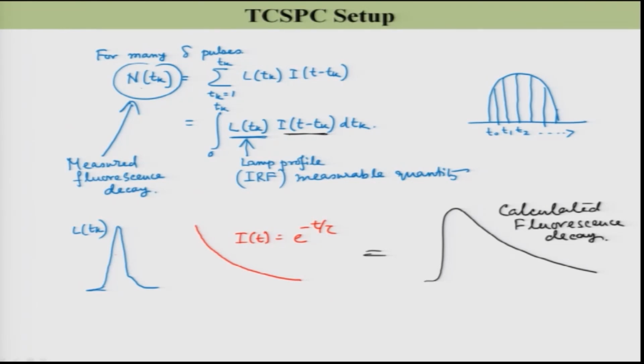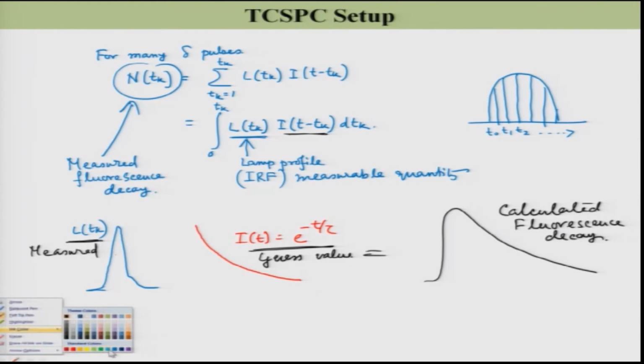What is your measured is over here. This is the calculated. This is your measured. This is the guess value. So, the measured one and this calculated one, let us say the measured one looks like this.